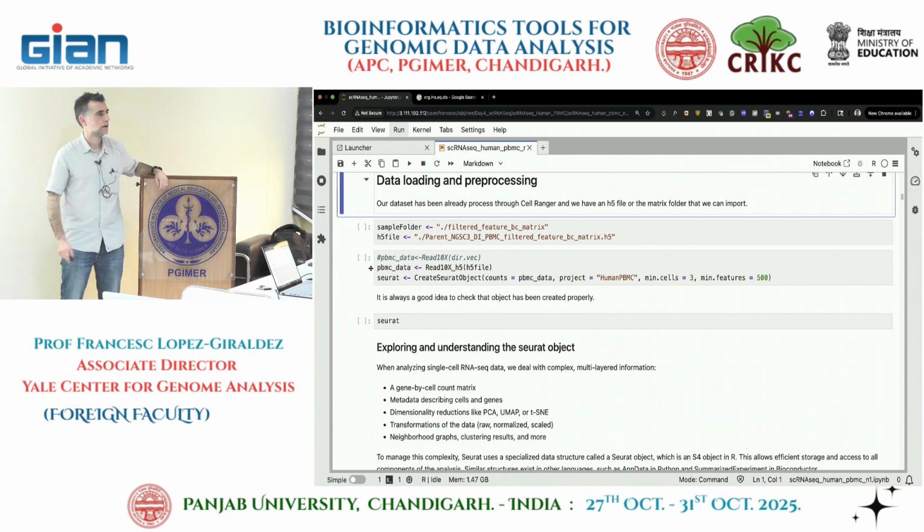Is there any cutoff that we have to take, this much only, or less, or more? This is part of what we said before. If you have enough cells and you only care about having the best data possible, increase those numbers. It depends on how many cells and reads we are getting. There's a lot of iteration in bioinformatics, even if you don't like it. I do an analysis, I see how the data looks, I'm exploring the data, and I say I should change my model, like in bulk RNA-seq. So let's go back, change the model, do the analysis. Same way here.